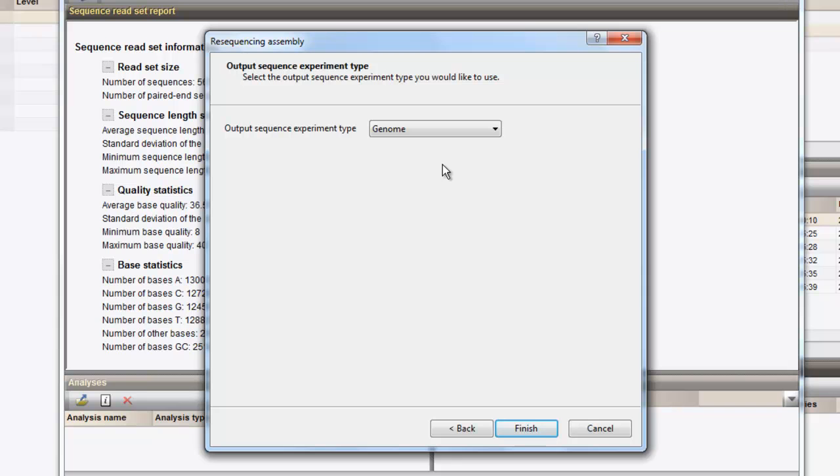When we later want to be able to perform a chromosome comparison of our reference genome against the resequenced genome or initiate a SNP analysis, both genomes should be present in the same sequence experiment type. For this reason, we already save it now under the same experiment name.